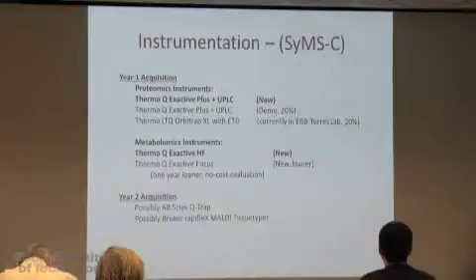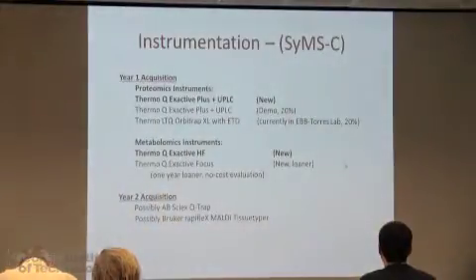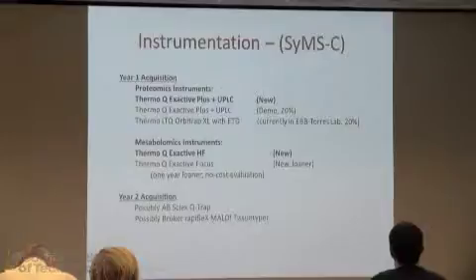So phase one of this deployment of instruments is pretty much ongoing. The instruments are here. They're pumping down. They're being tested as we speak. And then we have a second phase of instruments, where we're thinking about what capabilities we really want to add to the core as we have customers coming in and basically saying, this is what I want to do, this is what I do.